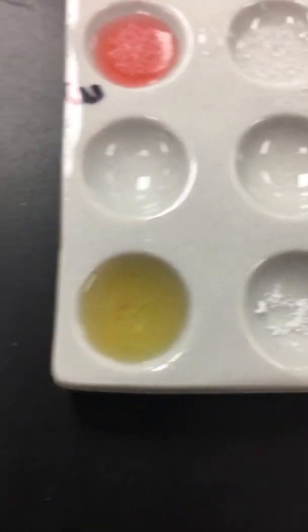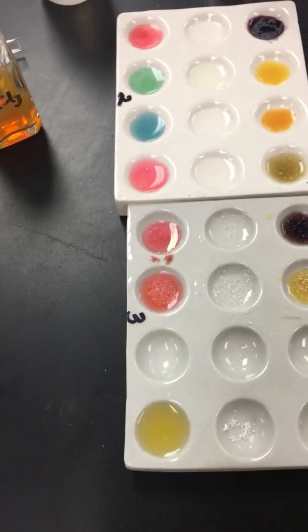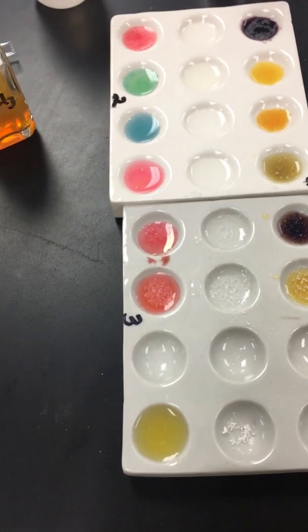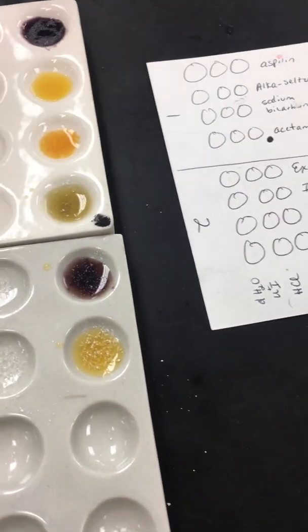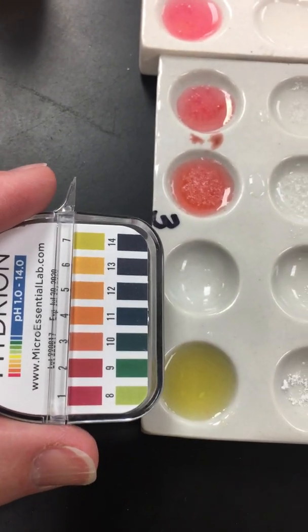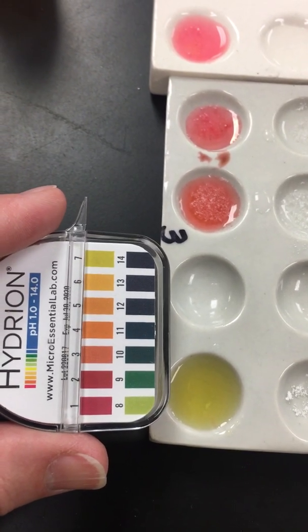Bubbled up a little bit in there. Color-wise, it looks sort of like that 7 or 8, maybe closer to the 8.